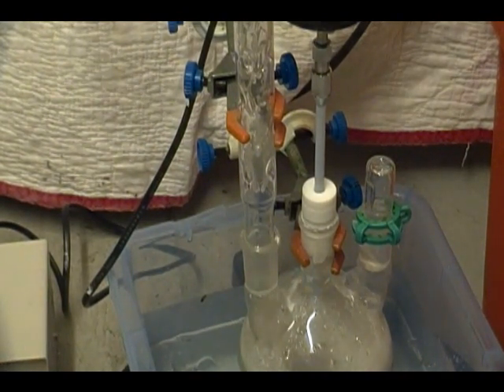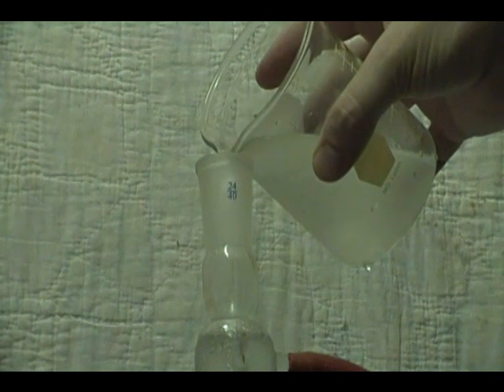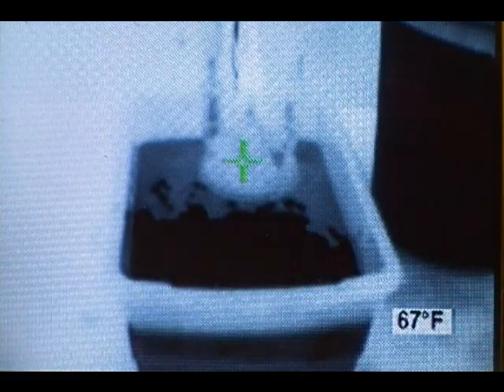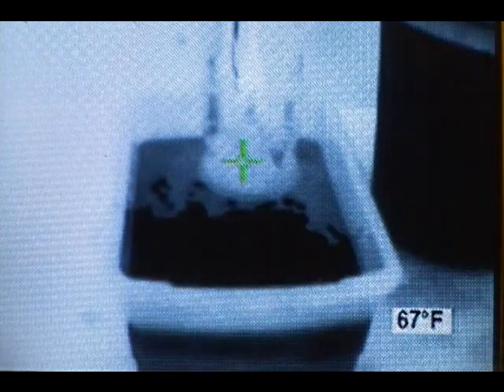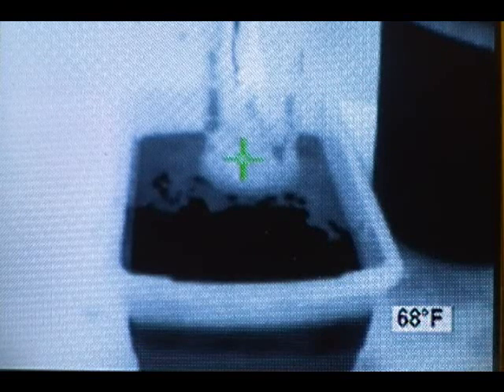Start the motor and add some acetone. Only pour in about 20 milliliters at any one time and about 20 minutes apart from one another — this will help keep the temperature down. This is an extremely exothermic reaction, and as you can see with the thermal camera, the temp is already around 70 degrees. If you put in too much acetone at any one time, you can get a runaway reaction. This is what makes doing this reaction so dangerous.